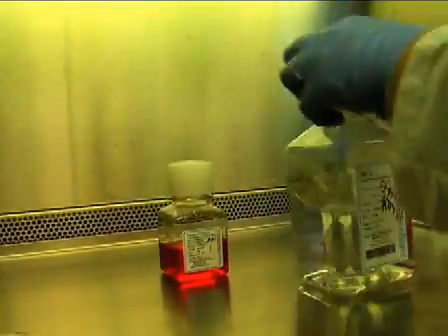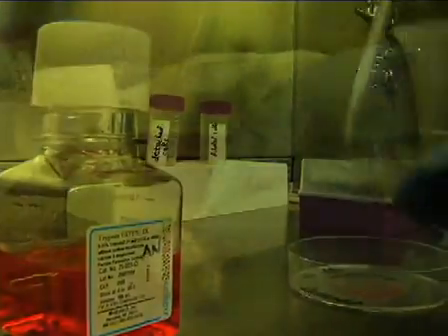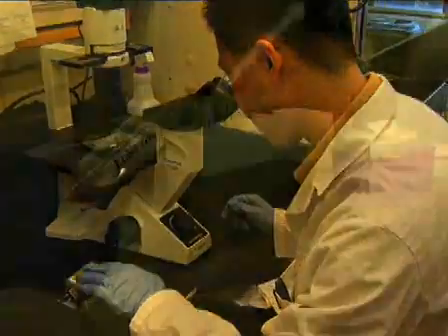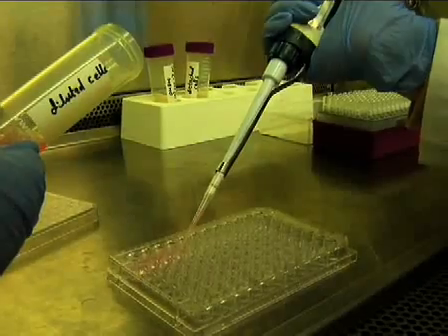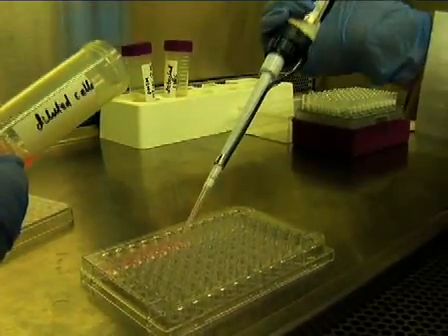Using a standard trypsinization technique, the cells are detached from the bottom of the dish, counted, and then plated on polylysine-coated 96-well plates, where they are grown for 24 hours until beginning transfections.